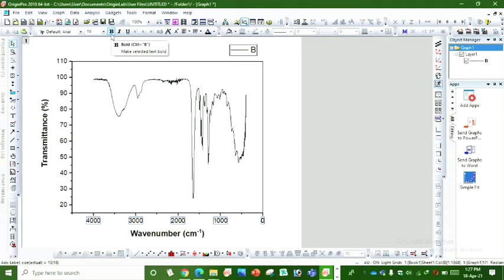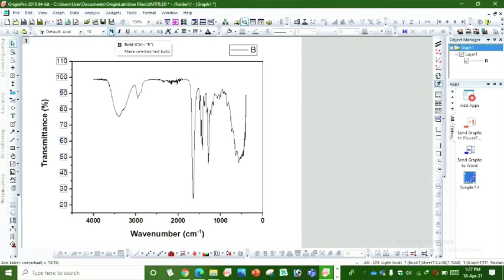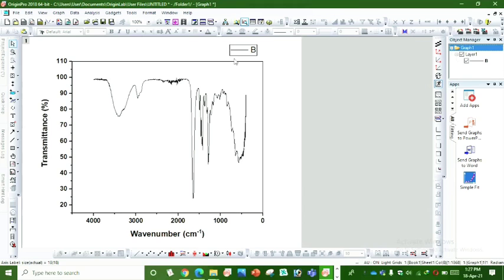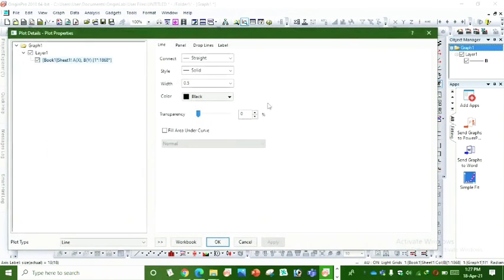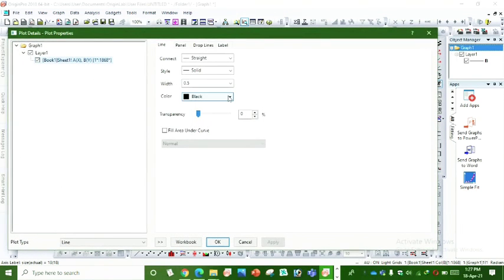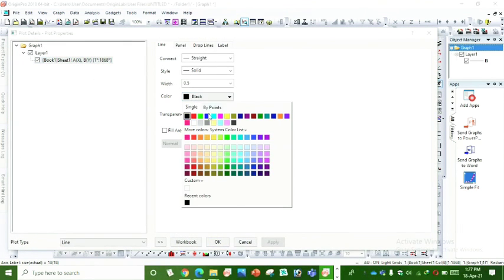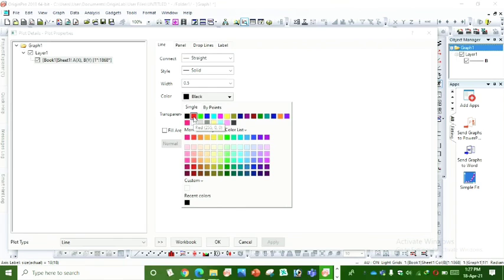And click on B so it will turn into bold form. To change the color of this graph, we click on this line and change the color to your desired form.